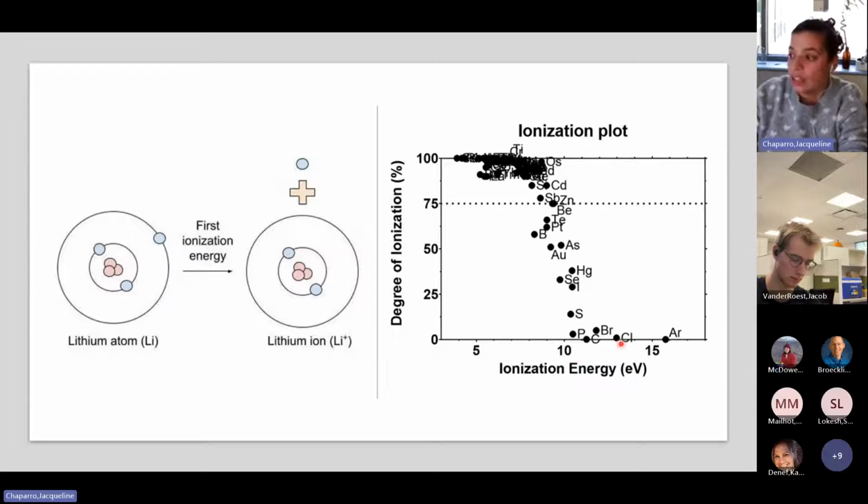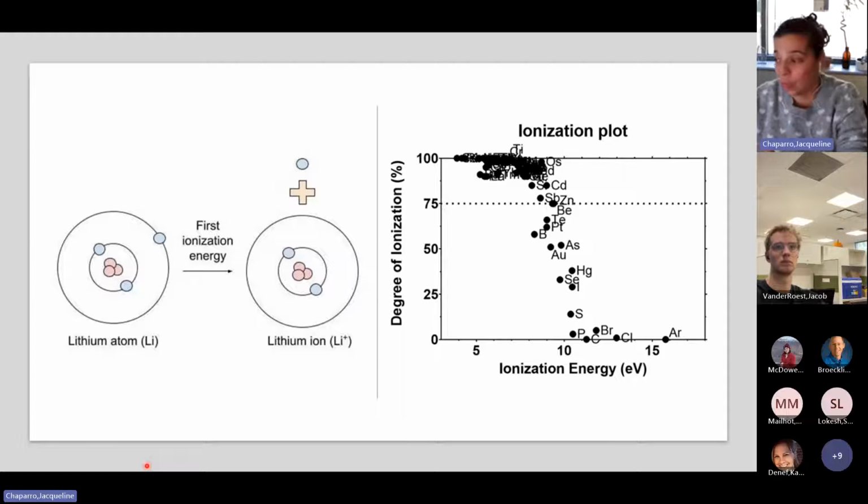So essentially, you can look at the halogens: chlorine, bromine, and iodine. While we can surely measure them by ICP-MS, their limits of detection become much more difficult because fewer cations are being formed, and it's much harder to remove an electron from these halogens.